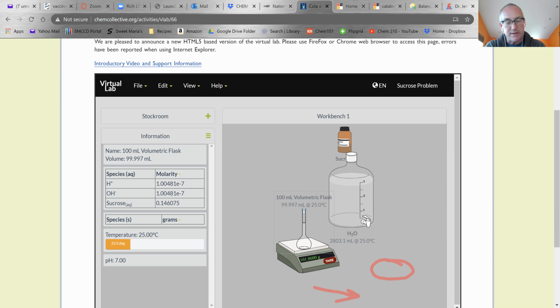So Jovan, what are the units? So I heard it was 1.01863. But what are the units? No, that is incorrect. Oh, wait a minute. No, that is correct. Sorry. Yes, grams per mil. Our density is going to be in grams per milliliter.